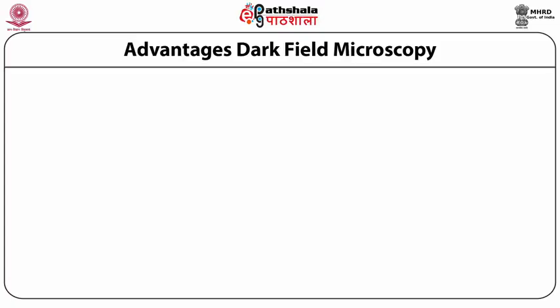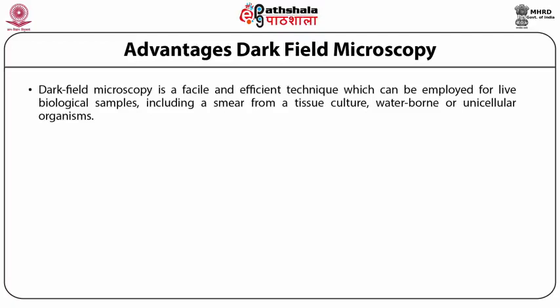Now, let us see the advantages of dark field microscopy. Dark field microscopy is a facile and efficient technique which can be employed for living biological samples, including a smear from a tissue culture, waterborne or unicellular organisms.